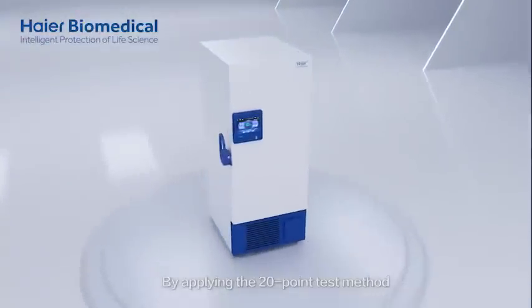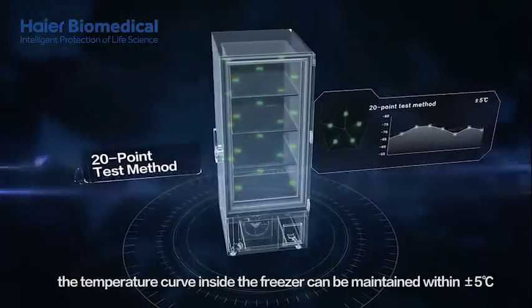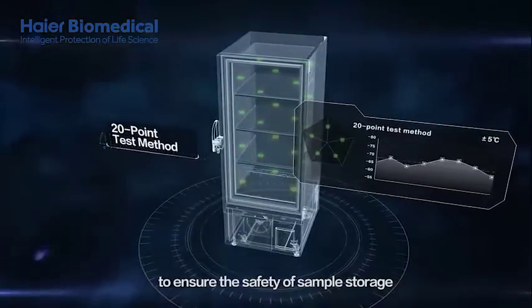By applying the 20-point test method, the temperature curve inside the freezer can be maintained within plus or minus 5 degrees Celsius, ensuring the safety of sample storage.